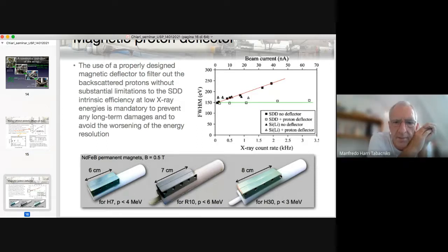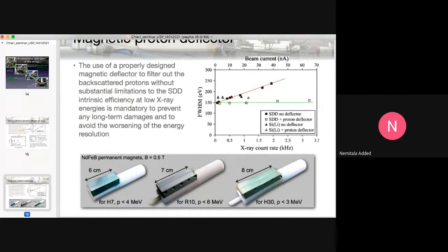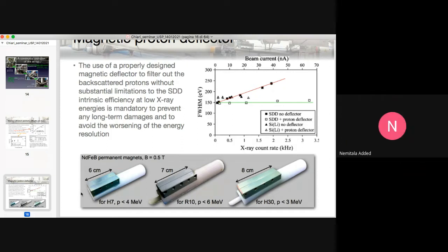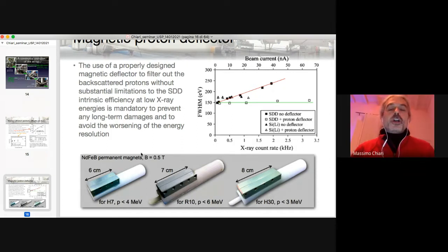Perfect, exactly. Alfredo, apologize, but just in this matter, the solution should be to put 2 magnets instead of only 1, and make a more homogeneous distribution of the magnetic field. You could put one each side instead of... We have 2. We have 2 slabs. Oh, I'm sorry, I thought... No. We have 2 slabs.